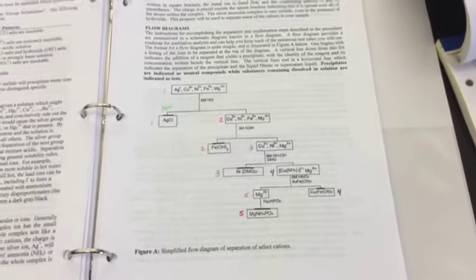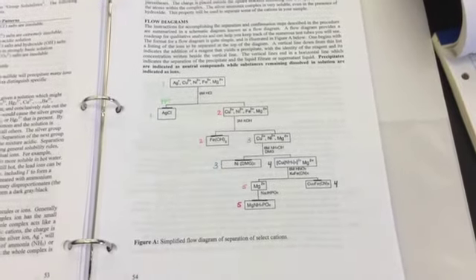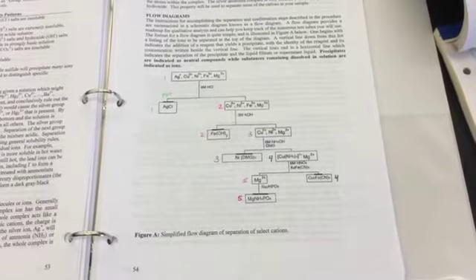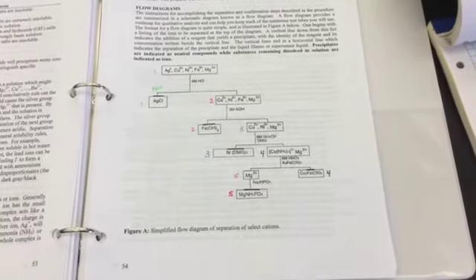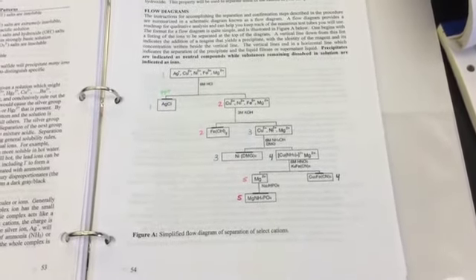So I know that in my first test tube, I'm going to have all of the ions, and that only the silver in the form of silver chloride will form a precipitate. It will remain in the first test tube, and the supernatant fluid will move into the second test tube. I've labeled this so that I can easily go back and reference this when I want to know what is in a particular test tube.